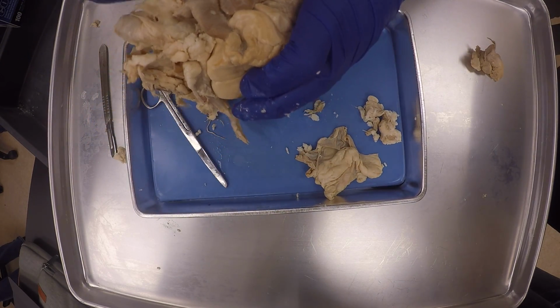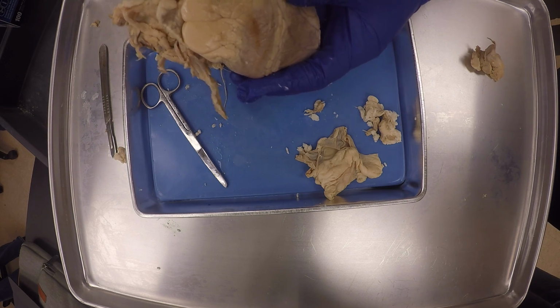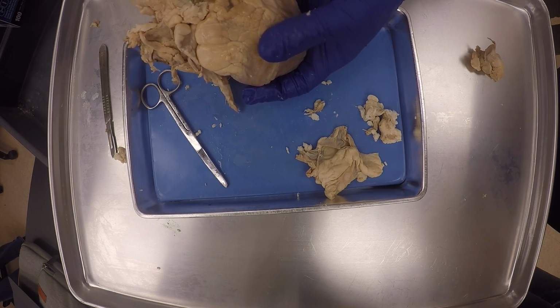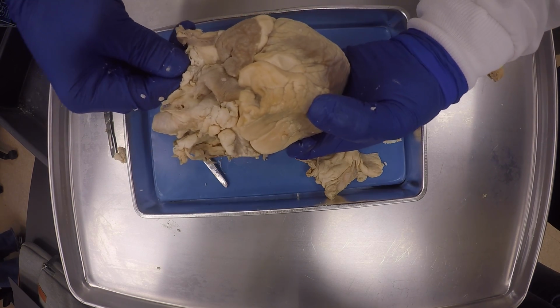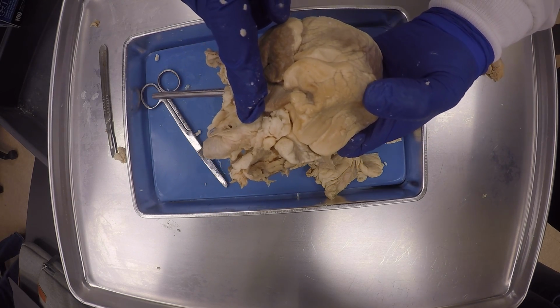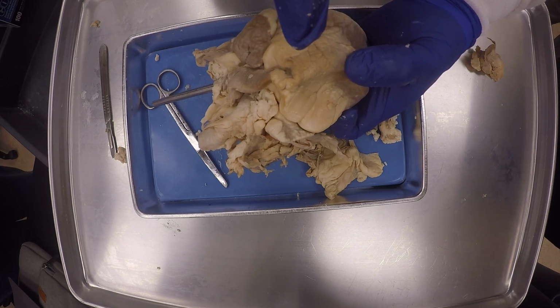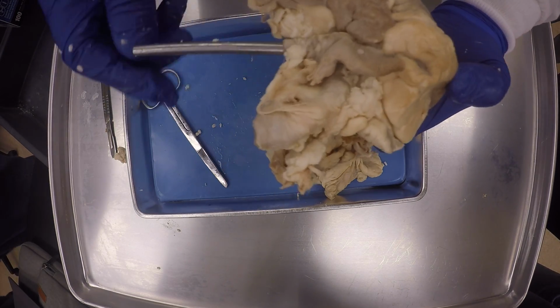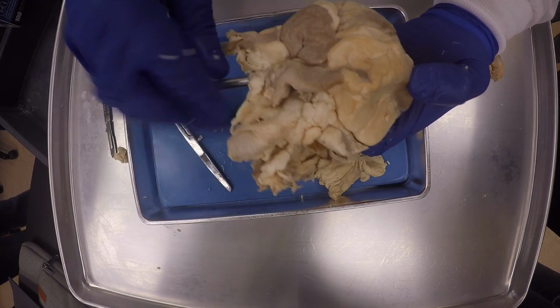Okay, so it's going through. You see, I can feel it right here on the right side. You see what I'm saying? So there's definitely the pulmonary trunk, and it's the second thing that you will use to confirm that it is actually the anterior side of the heart. The pulmonary trunk goes out at an angle like that, okay? The pulmonary trunk splits into the left and right pulmonary arteries, okay? Very good.